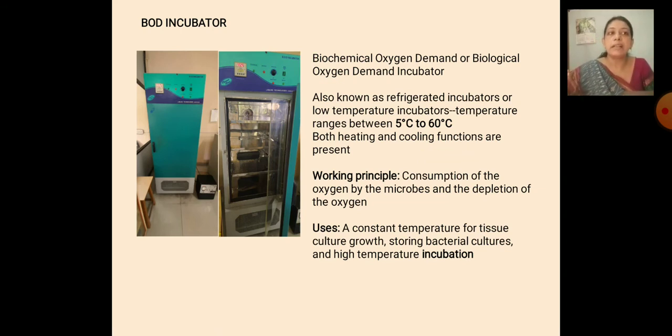That is, both a cooling temperature as well as a high temperature can be used, and incubation of microorganisms, especially bacteria, can be done. Here the cultures as well as fungi are stored, and the constant temperature required for tissue culture, that type of culture can be grown.